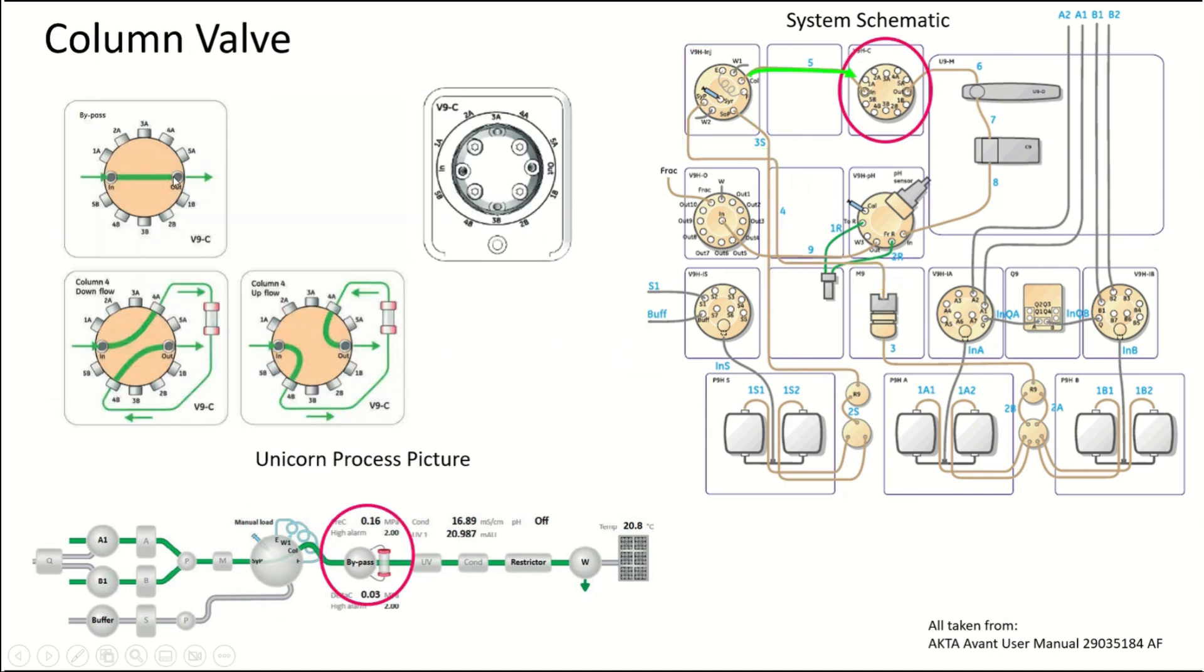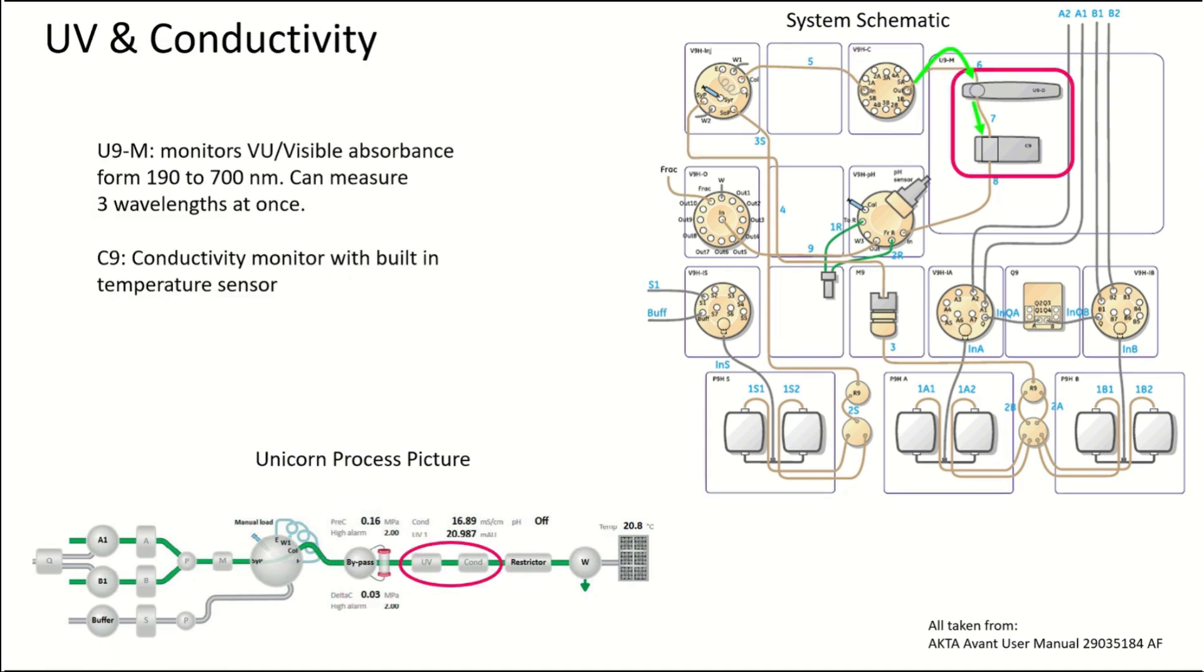Next we have the column valve. The column valve is really neat—it can house five different columns at the same time, and each column can run in both downflow and upflow positions. After the column valve, we have the UV monitor which can see any UV absorbance from 190 to 700 nanometers and can measure three wavelengths at the same time.